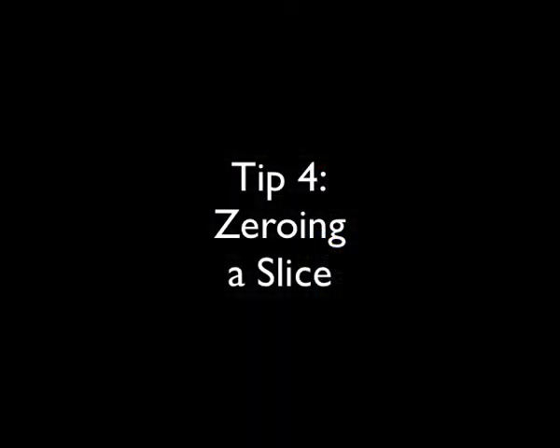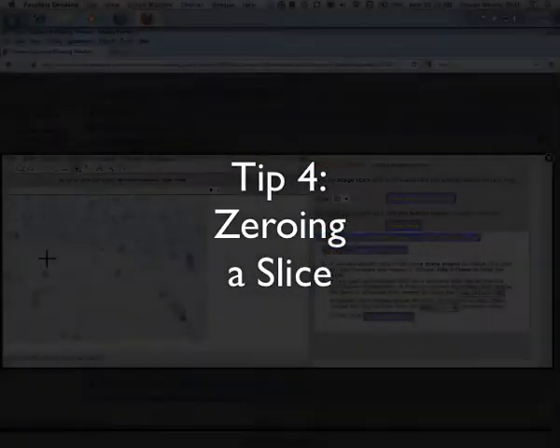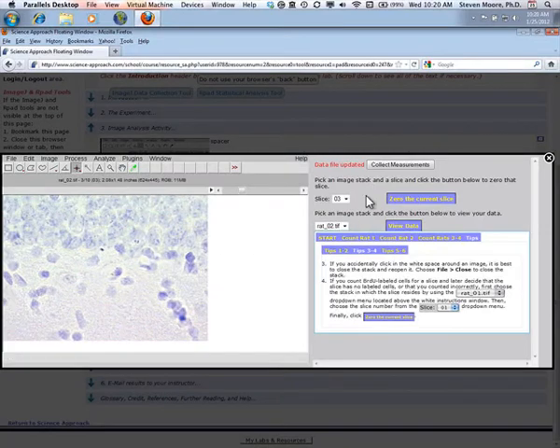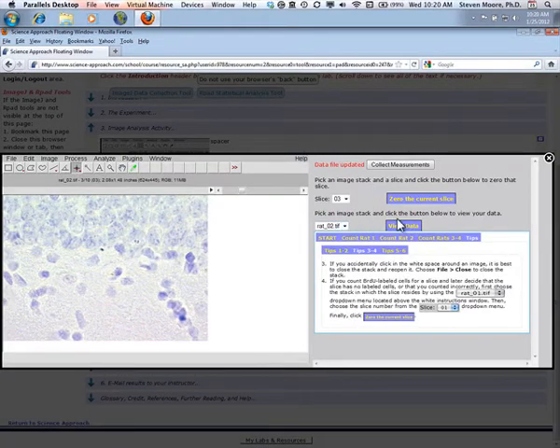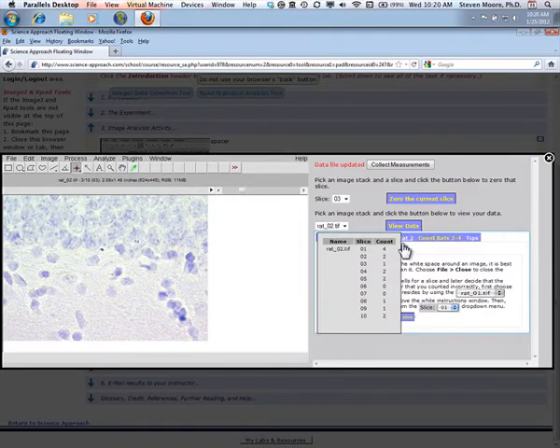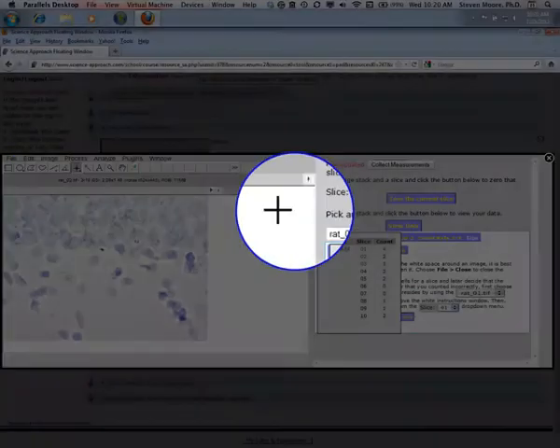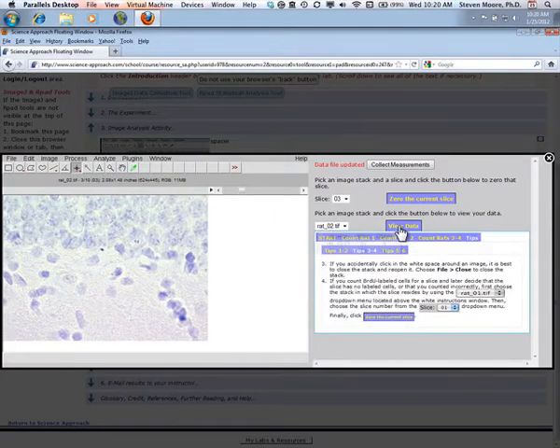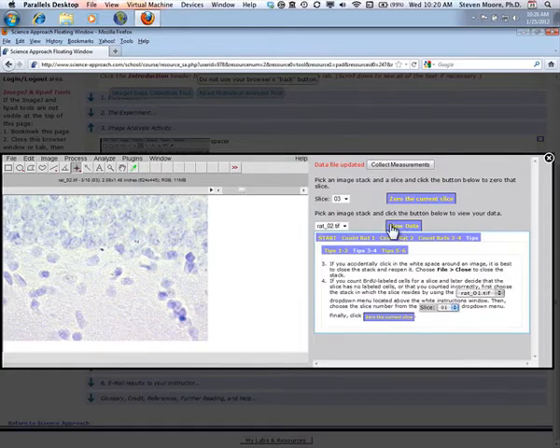If you count BRDU labeled cells for a slice and later decide that that slice has no labeled cells, you can zero the slice out by selecting the proper stack in one drop-down menu and then the proper slice. Then click Zero the Current Slice. You can check your data by clicking the View Data button.